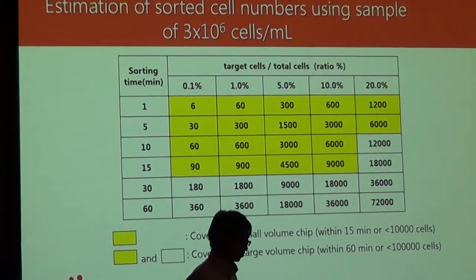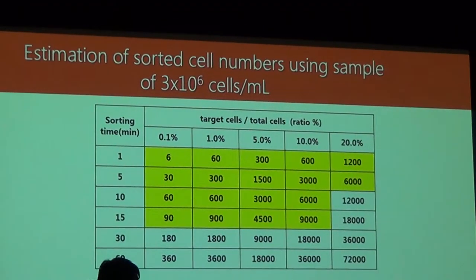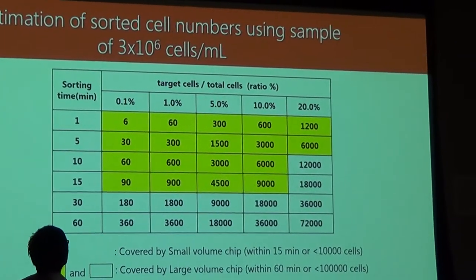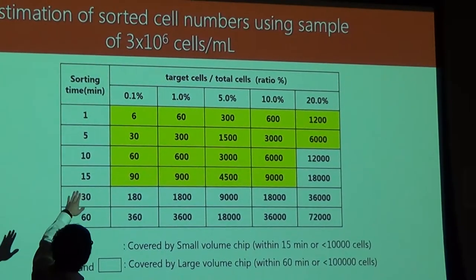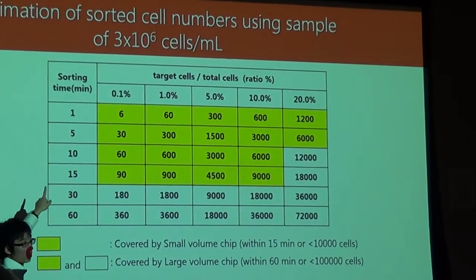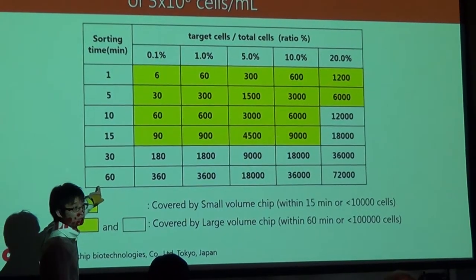And this slide just gives you an idea of how many sorted cells you can in the end collect. Don't worry about the yellow and white part, that just means that you're using different chips. But in the end, we have the sorting time, and depending on the concentration of your target cells overall, those are the numbers that you get in the unit of minutes here.